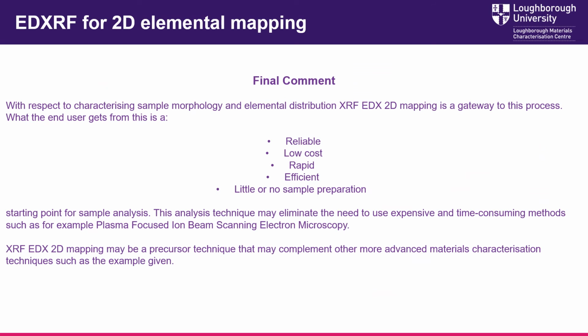Final comment. With respect to characterizing sample morphology and element distribution, XRF EDX 2D mapping is a gateway to this process. What the end user gets from this is a reliable, low-cost, rapid, efficient, little or no sample preparation starting point for sample analysis. This analysis technique may eliminate the need to use expensive and time-consuming methods, such as, for example, plasma focused ion beam scanning electron microscopy.